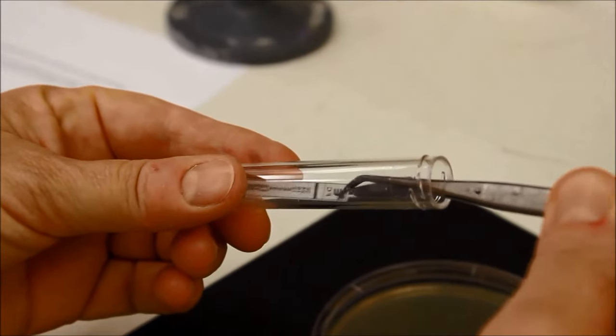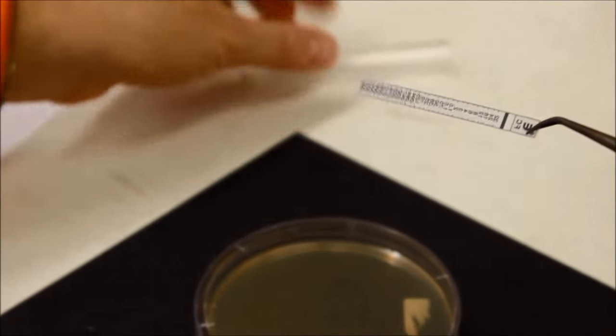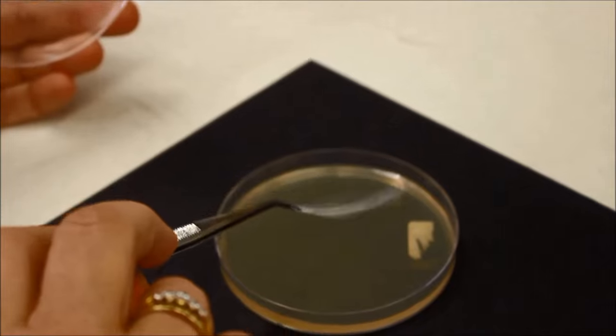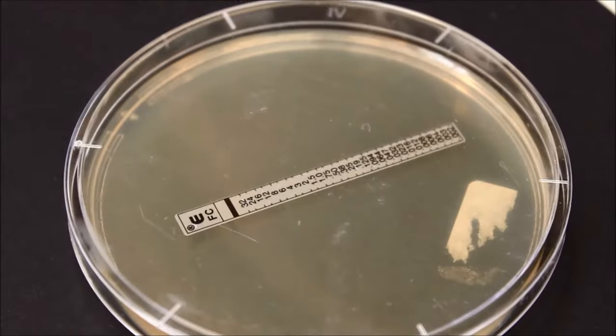Handle the e-test strip with sterile forceps, gripping only the part of the strip labelled E. Apply the strip to the inoculated agar surface making sure the MIC scale is facing up.